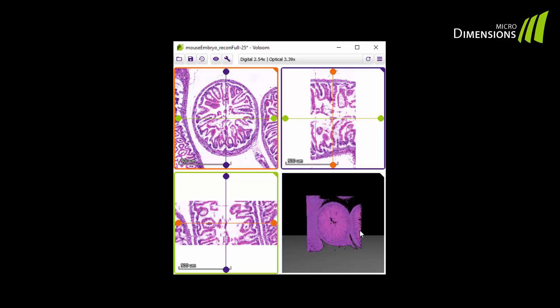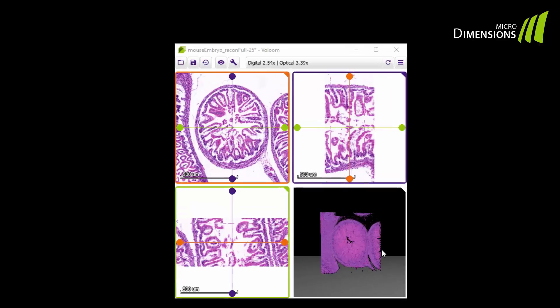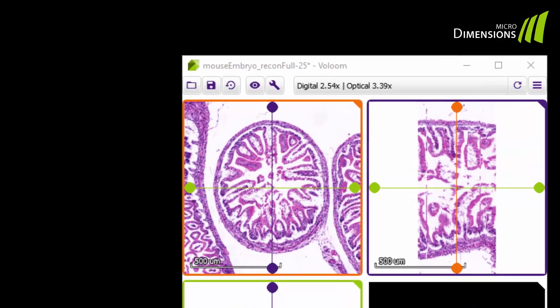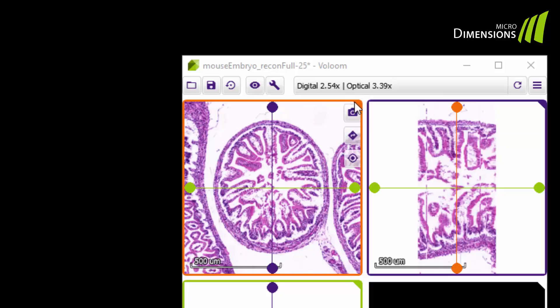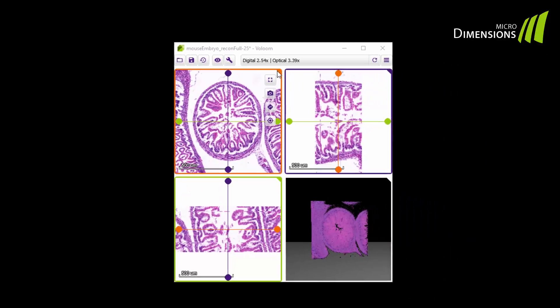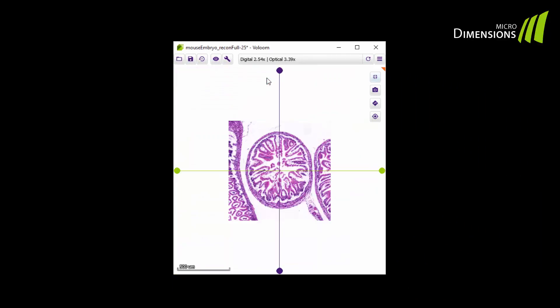In the upper right corner of each of the four views you find a small triangle. Hover over it with your mouse and the menu opens. The first button allows you to enlarge the view to full window size. Click again to minimize it.